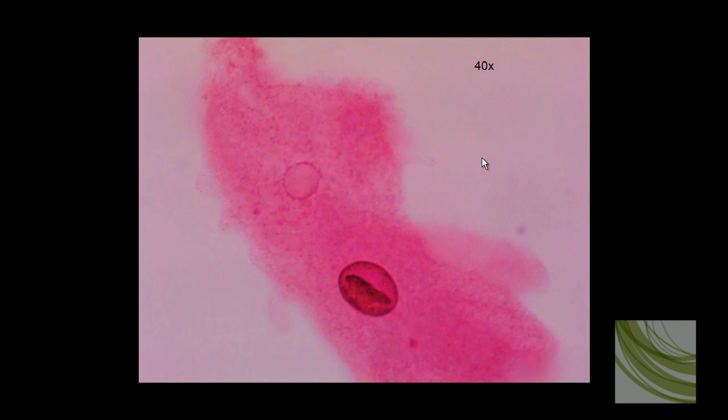Here is the same amoeba using the 40x objective. We can see several other very interesting little structures here. Obviously we can see our nucleus, but here is a large contractile vacuole. It looks like we can see a couple little food vacuoles buried deep into the cytoplasm.